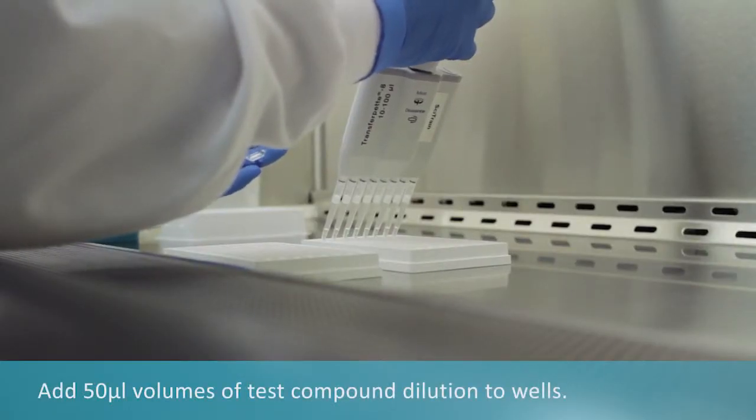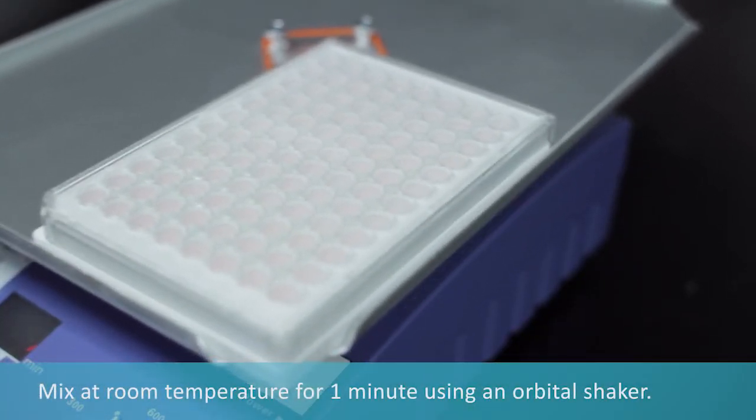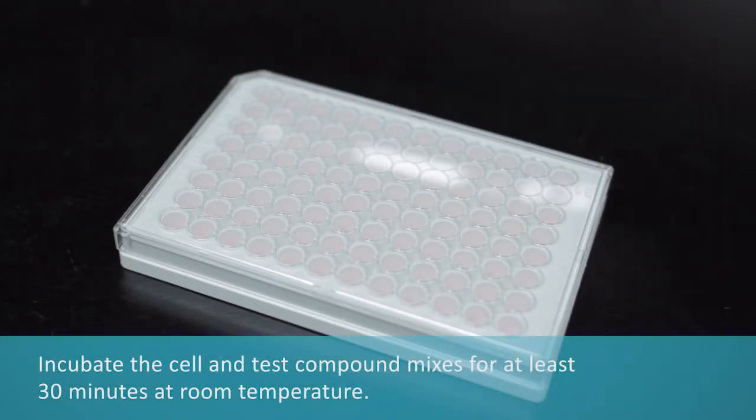Add test compound dilution to the plate wells. Mix briefly using an orbital shaker. Incubate cell and test compound mixes for at least 30 minutes at room temperature.